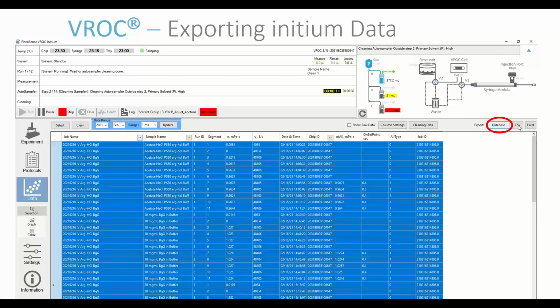In fact, when you're starting up with Clariti, you can export your data as both a database for Clariti and an Excel file, to just play around with your data as you get more familiar with Clariti.